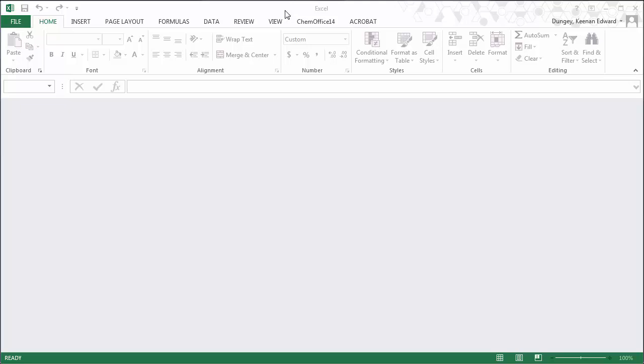In this video, I'll show you how to import the data from your electrochemistry lab report into Excel and do the statistics that you need to calculate your X and Y error, and then how to create an X and Y error bar plot in Origin.